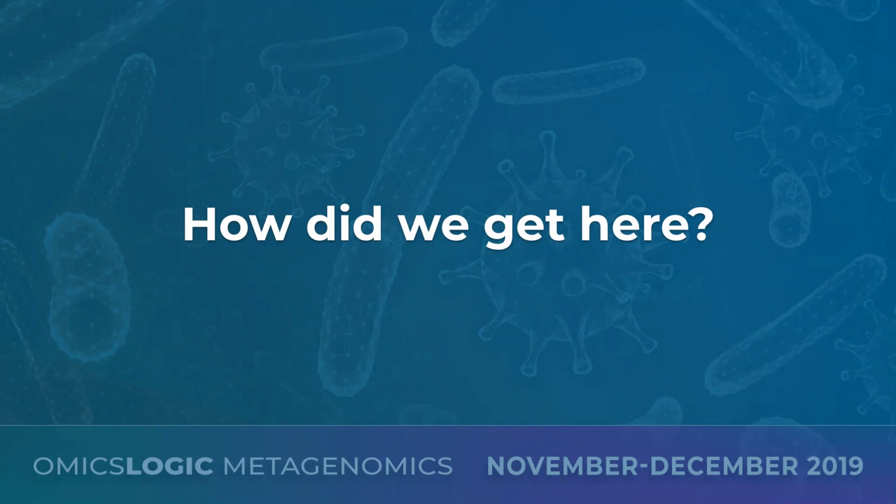So in today's lecture, we want to talk about how did we get here? What is some background information? Why are we even turning to sequencing to study metagenomics? And then we'll talk about some of the sequencing techniques, and what do they allow us to study essentially? What kind of data can we generate? So when we talk about how do we get here, we're really talking about the history of metagenomics.